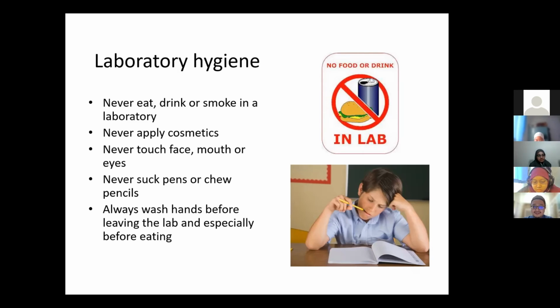Good habit ya. Awak rasa awak sterile macam mana pun, okay, bila awak nak keluar lab tu dah pakai hand sanitizer semua dah, tapi before eating you mesti wash your hand again, yeah, because you do not know what is on your hand, what have you touched in the lab.